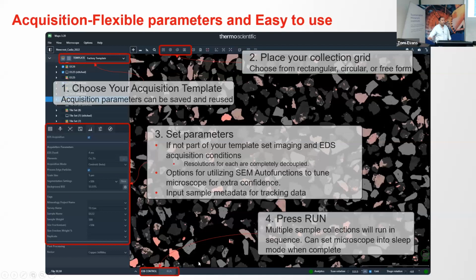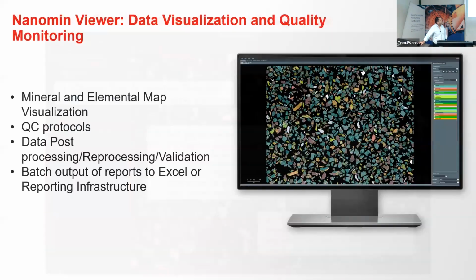And that's it. And please run. If you load them all at once, then you can just do all the setup with two clicks, basically. I have a recording that shows you a little bit better than that. Then when the acquisition is finished, the stitching is done automatically, using a feature recognition algorithm.